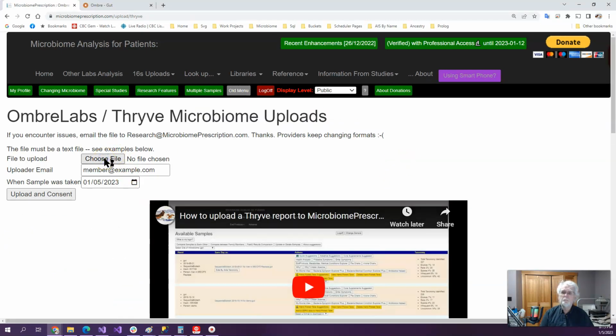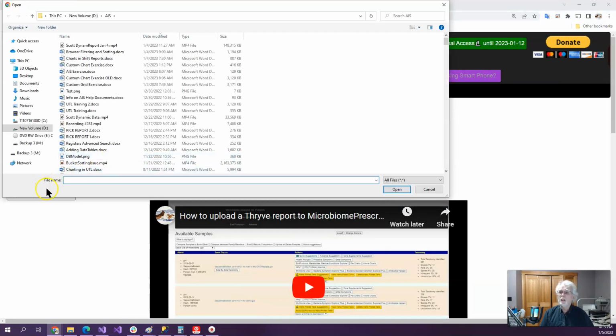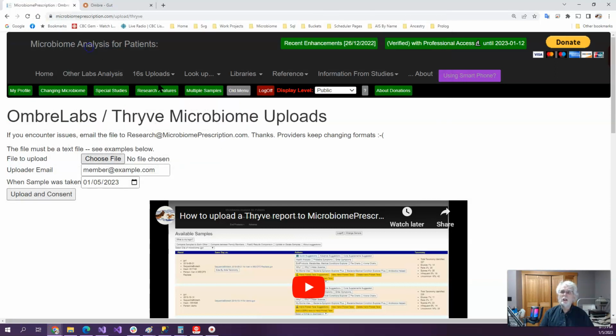Choose the file, and navigate to where you store it. Here it is, and see my name is in the front of it. Click that. There, I need to add my name here, so I'll just type in the email I want to make use of.